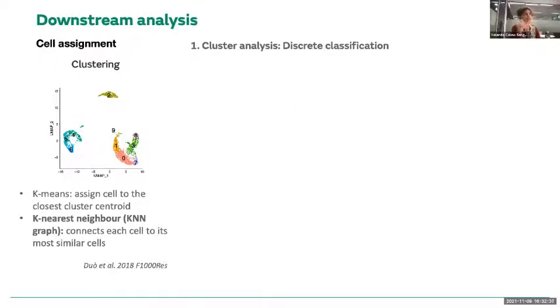And the number of clusters will also depend on how many cells you have. Sometimes when you have many, many cells, you can increase the resolution a lot, but then you will have so many clusters that it's hard to deal with. So it's better to put a lower resolution and group things in bigger groups, and then take that subgroup and recluster it at a higher resolution.